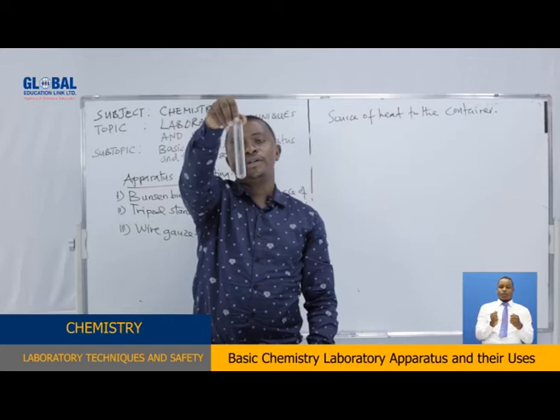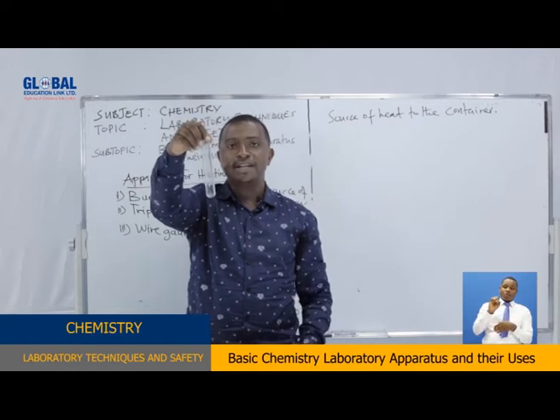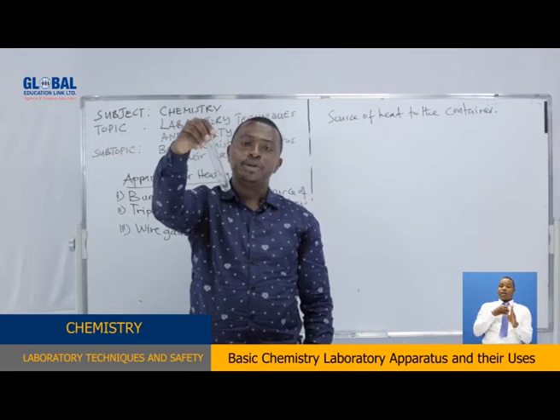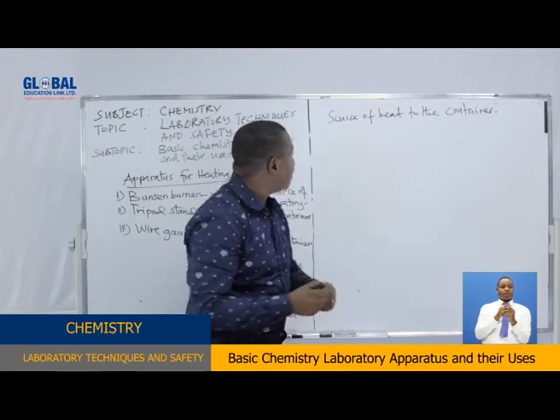So this is a test tube. Sometimes it's called a boiling tube. A boiling tube is somewhat larger than the test tube. So it is purposely used for heating chemical substances. It contains the chemical substance to be heated. We also have the boiling test tube.